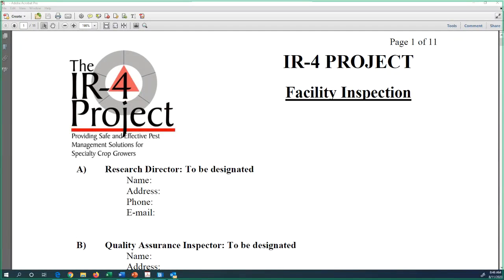One general query is: is it necessary for a pesticide residue laboratory to be accredited? Is it true accredited lab results are more acceptable and reliable than others? On the first question, is it necessary to accredit the lab? The answer is yes.